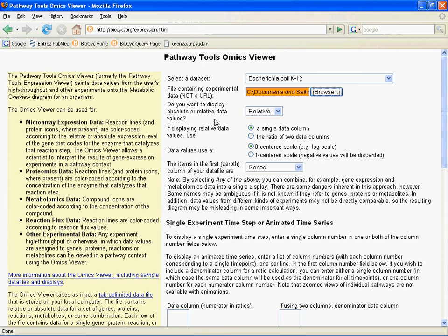Then it asks: do you want to display absolute or relative data values? In this case we're going to use relative values. Relative values means that before uploading this tab-delimited text file, we already normalized the data — we've compared our two fluorescent colors or however we did this, and we have our baseline dataset and our time points normalized. We don't need to do any additional processing here. But if you wanted to do that, you could. You can also display relative data values using a single data column or the ratio of two columns.